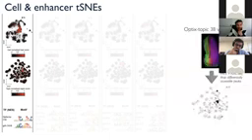We can also validate this experimentally. So in this case, we focus on this topic here, anterior to the furrow, and we used a fly line, a genetic driver that expresses GFP only in the domain anterior to this morphogenetic furrow, so only in the domain of the progenitors in the eye disc. And then by FACS sorting these GFP positive cells and performing bulk ATAC-seq on them, we could find the regions in the genome that are specifically accessible in this green domain and map them to this enhancer t-SNE. And indeed, they are the regions that we had already found by single cell ATAC-seq. So this could be validated in this way.